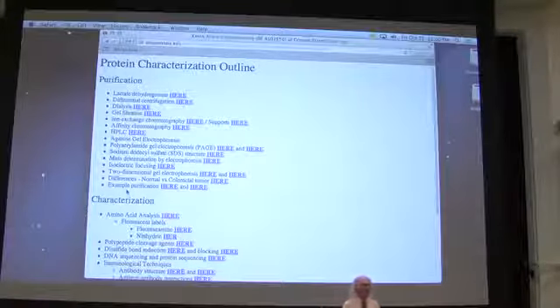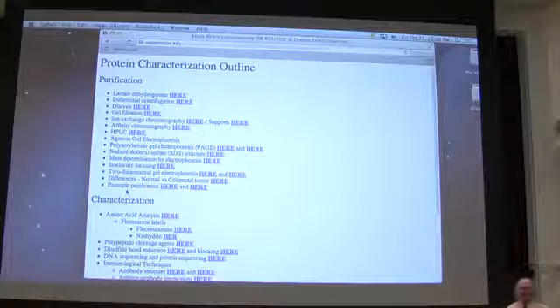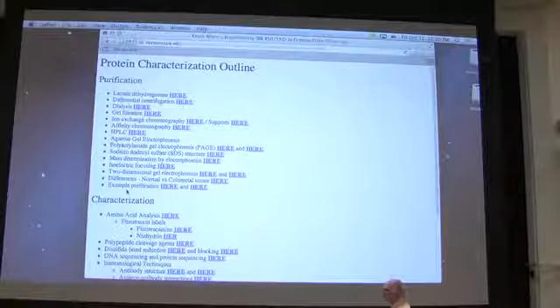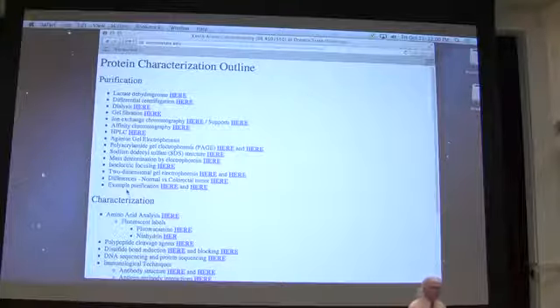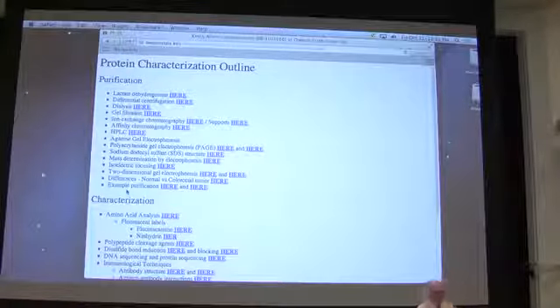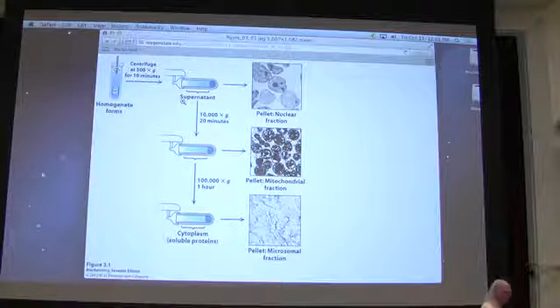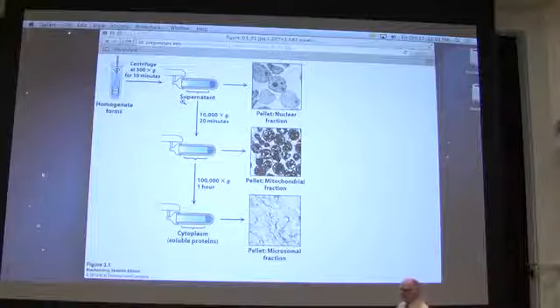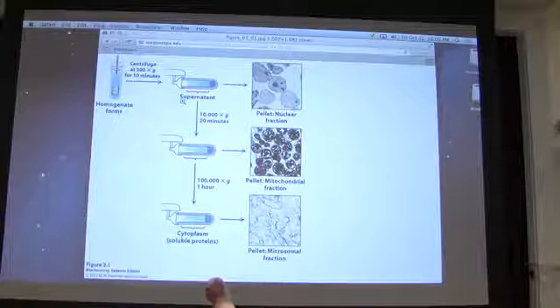So we're turning our attention for a couple of lectures to techniques that we use in biochemistry, specifically to isolate large, and in some cases, small molecules. Okay? It's mostly relevant for the proteins we've been talking about, but we'll talk about some other things as well. All right. Well, the number one tool that you see biochemists use in a laboratory, you can't walk into a biochemistry laboratory without finding a centrifuge. Okay? So a centrifuge is something that is ubiquitous, and it's a tool that allows us to do a sort of gross separation on the basis of size. Gross meaning rough, okay? Not gross meaning bad.